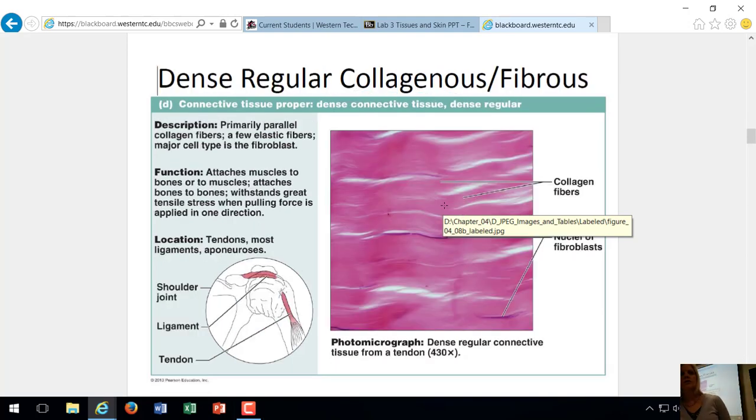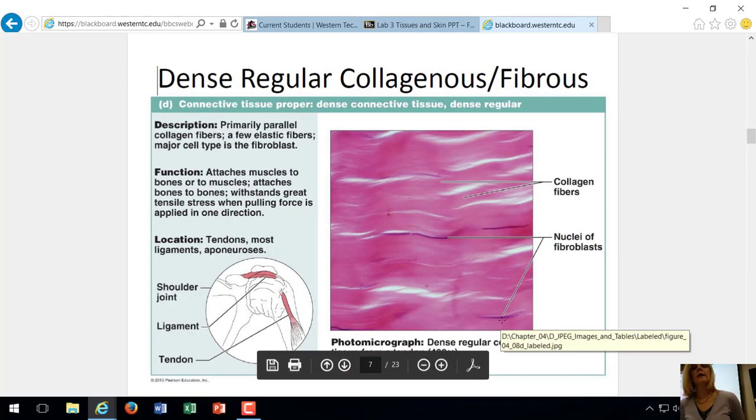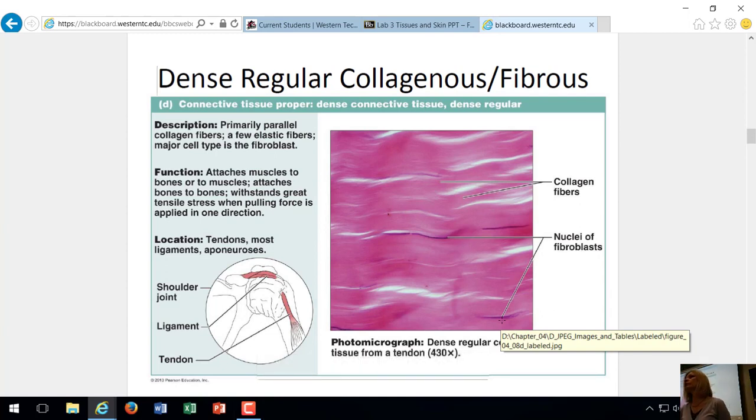Another connective tissue is dense, regular, collagenous. You can call it that, all three of those words, or you can just call it fibrous. If you'd rather just remember it as fibrous connective tissue, that's fine. Connective is the classification again. Where we find this is ligaments and tendons. So it attaches muscle to bone and bone to bone. Tendons attach muscle to bone, ligaments attach bone to bone.